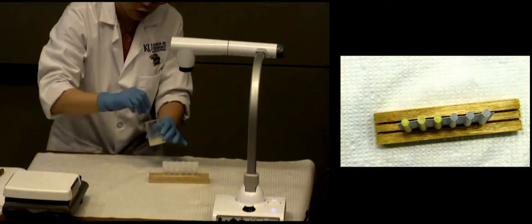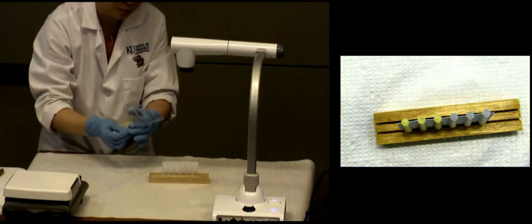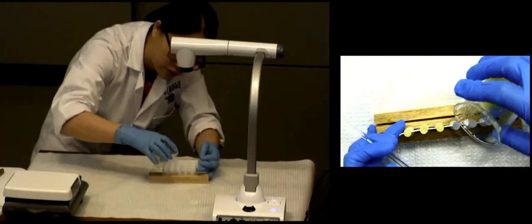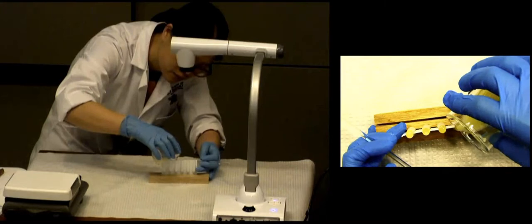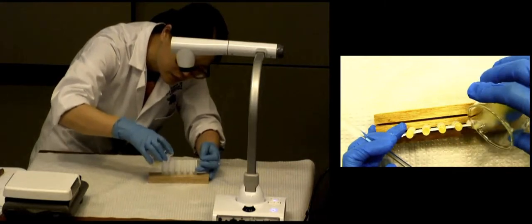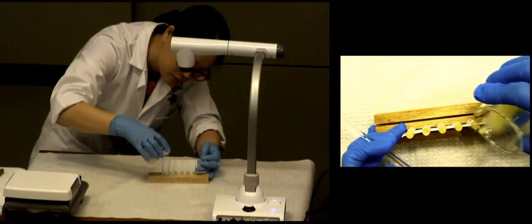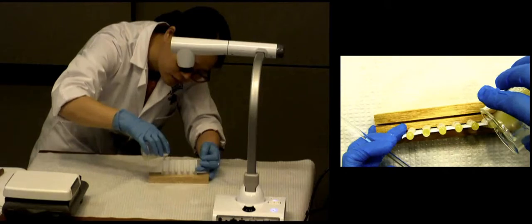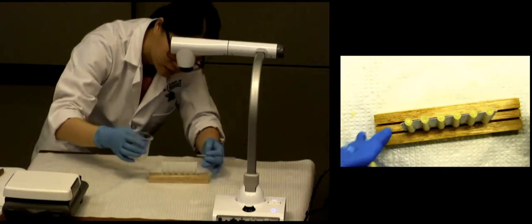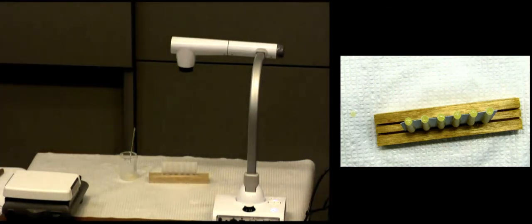So as you go into somewhere in the middle, you probably want to stir again because some of the particles may precipitate to the very bottom. A little bit easier with aluminum molds, but it's still a little bit of fine motor skills. Some people were appearing a little stressed yesterday because you spent a lot of effort to try to get it right, so you got to get it into the molds and get them filled to the correct level.